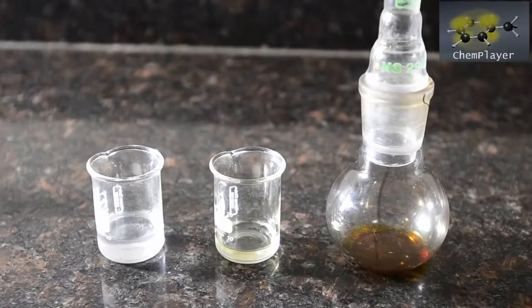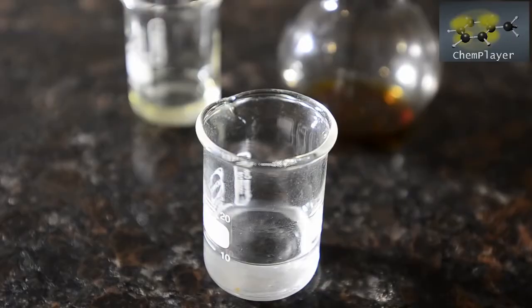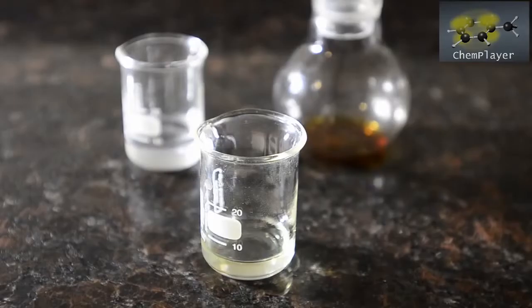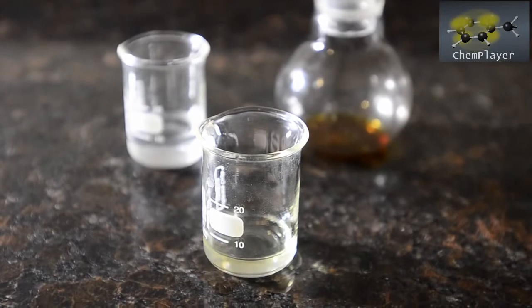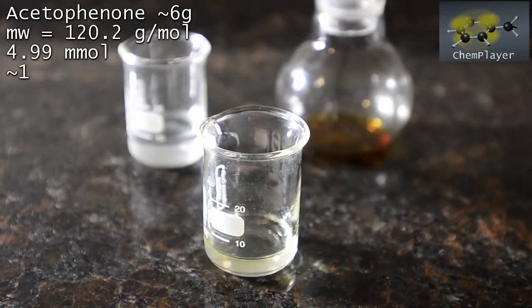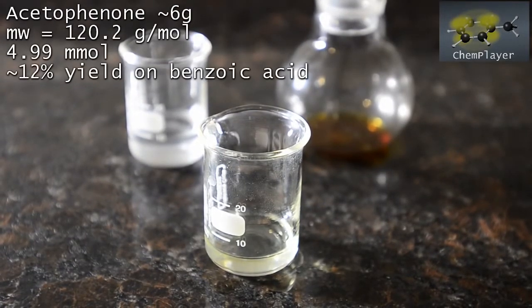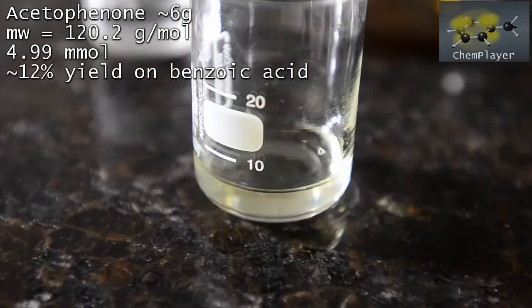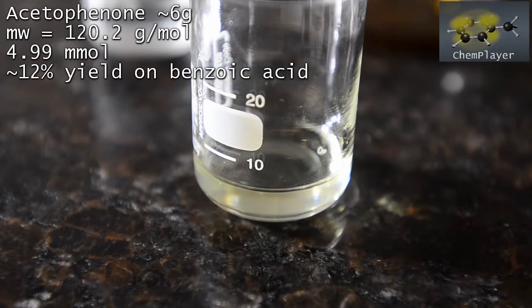Here's our 3 products. First up we collected about 10 mils of acetone, the product of calcium acetate reacting with itself. And next we've got about 6 grams of acetophenone boiling at about 200 degrees C. If you calculate that yield based on starting benzoic acid then it comes out at just over 12%.